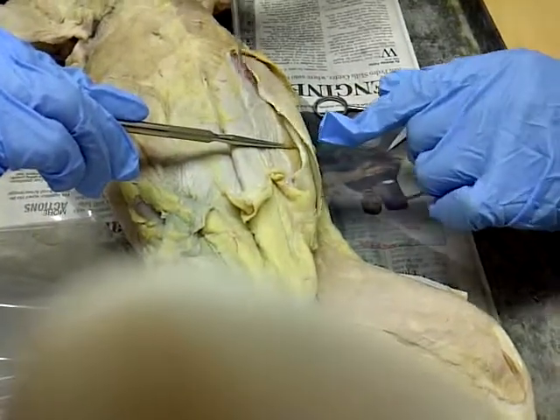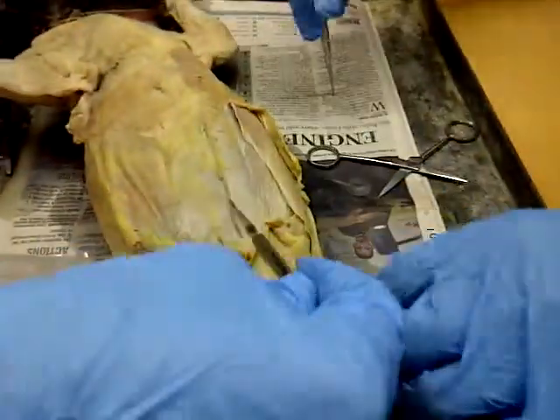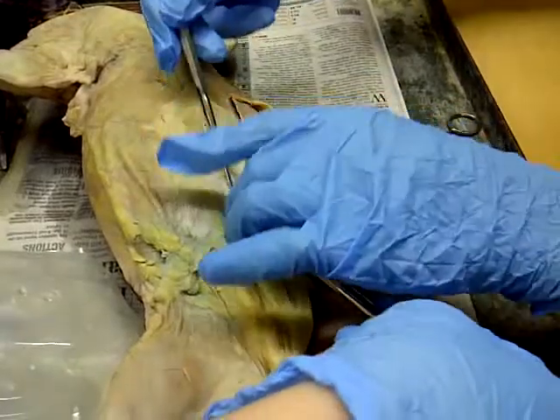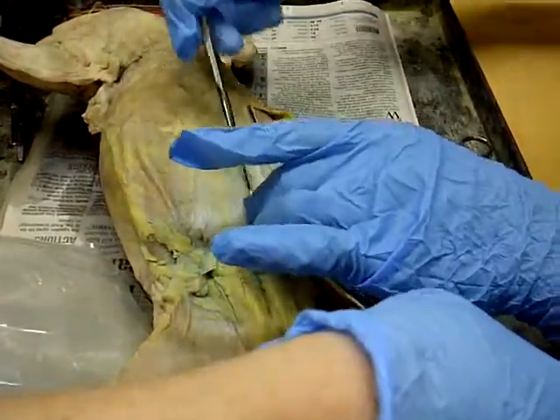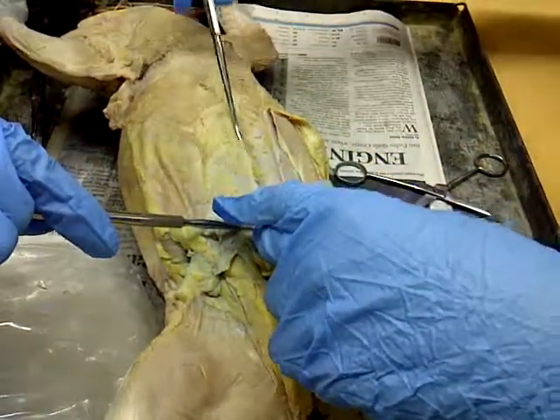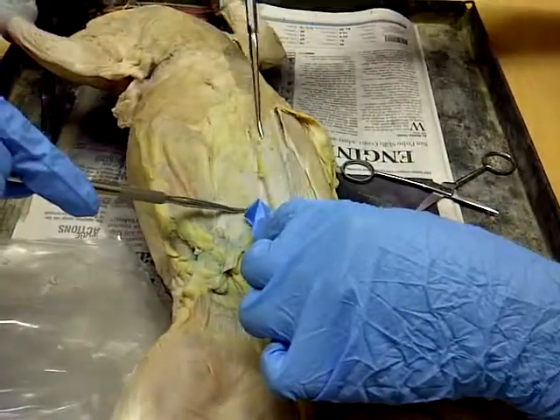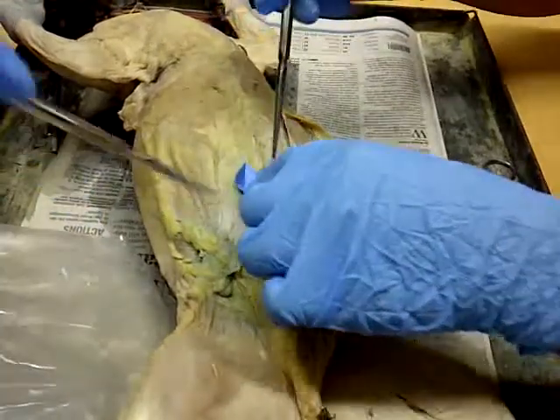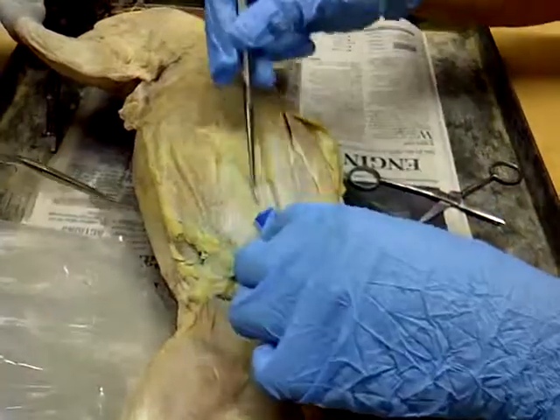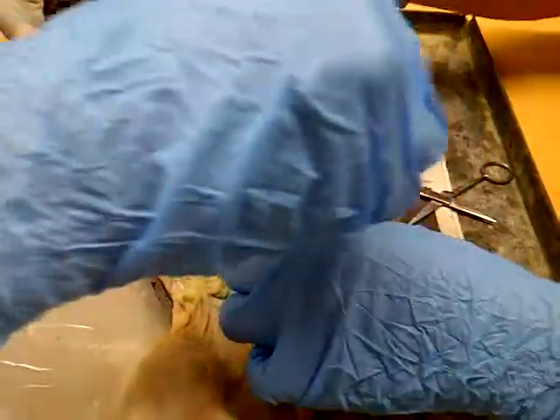I'm going to play the repeat game with you guys so that everybody gets it memorized. This line down the middle is the linea alba. The muscles on the sides of the linea alba are the rectus abdominis.